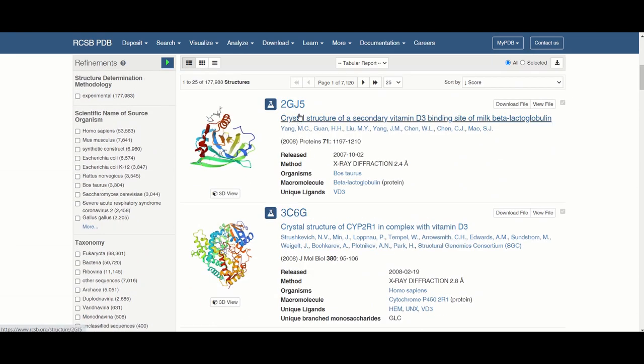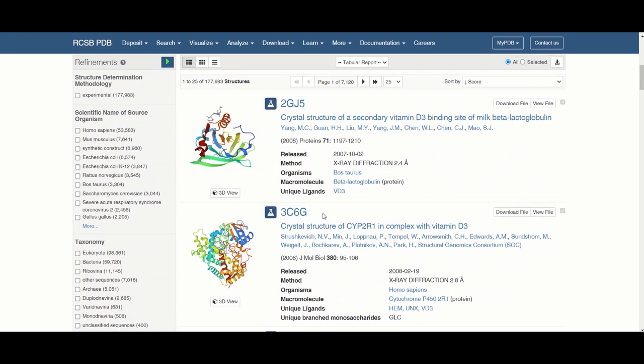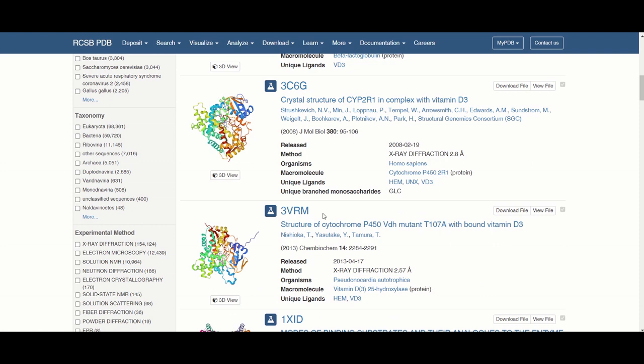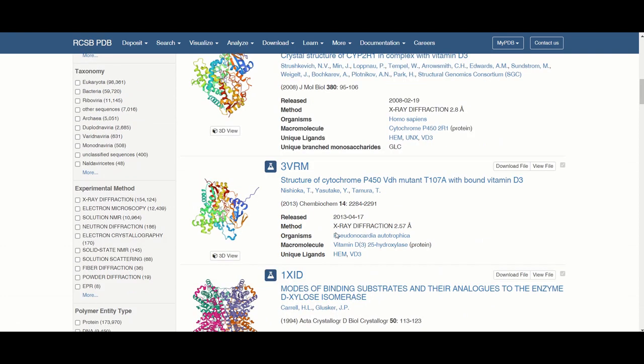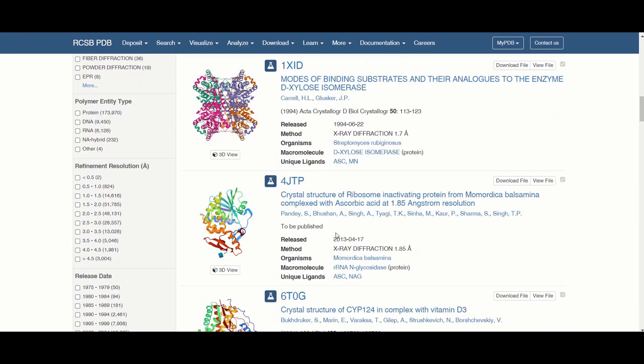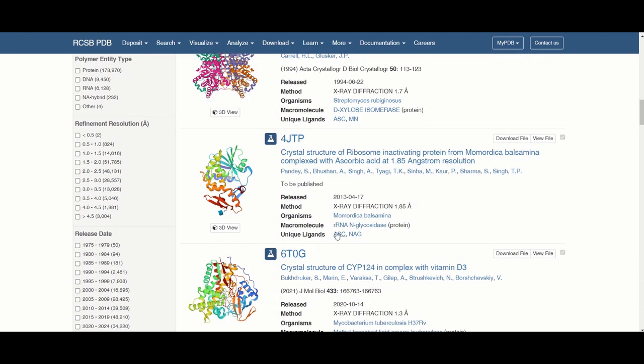Also they all have a unique code which this one's 2GJ5, this one is 3C6G, and if you ever want to look up a specific structure that is found in whatever publication, that publication should have this code so you can easily find that specific receptor.